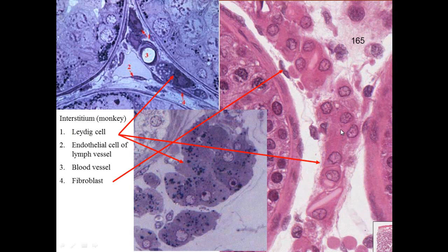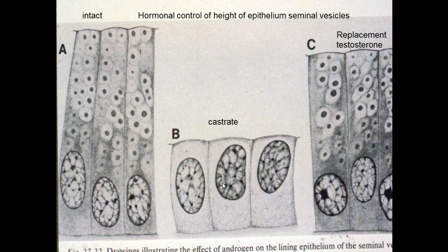Remember from part 1, testosterone is produced by the Leydig cells. Here we see Leydig cells between the seminiferous tubules - different profiles of Leydig cells that produce testosterone. Testosterone is important in maintaining secondary sex characteristics and epithelial height. Here we see the seminal vesicles with a typical height of epithelium with secretions above the nucleus. If you castrate the individual they will go to a basal layer without secretions, and with replacement therapy the secretions and epithelial height will return, though not quite to the intact level.